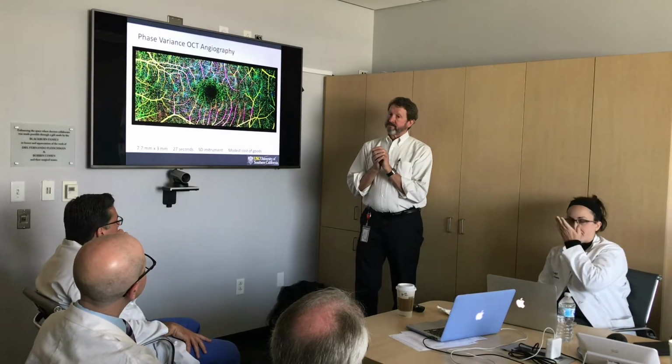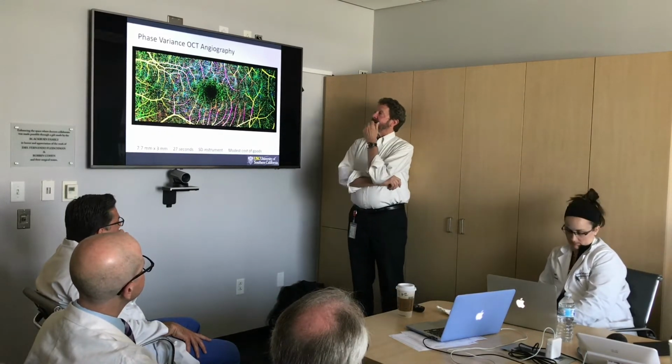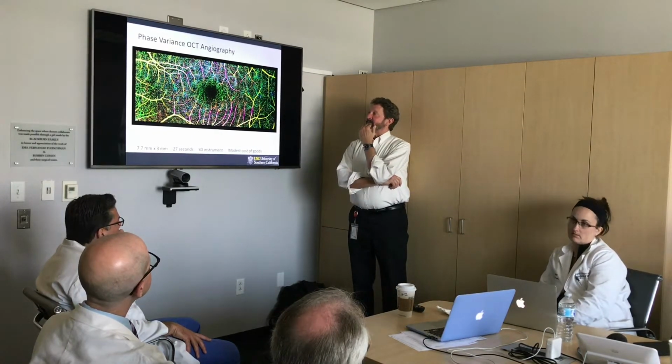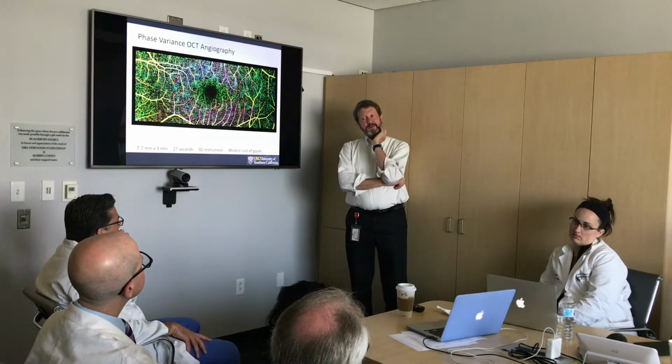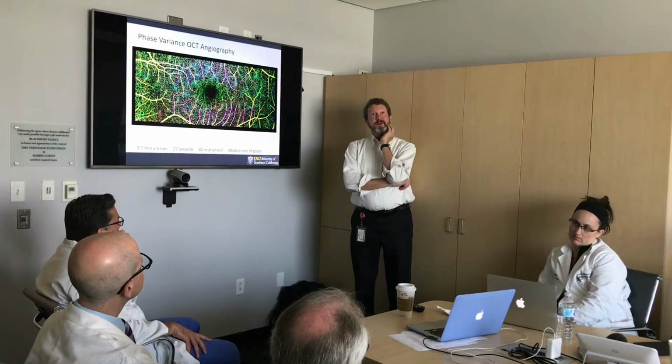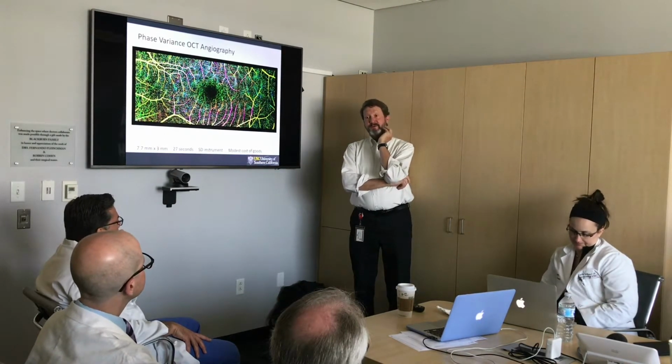And what kind of depth can you get? We haven't established how deep it could go depending on the wavelength. You should be able to go millimeters. Probably 4 millimeters would be a reasonable limit and still get good performance.